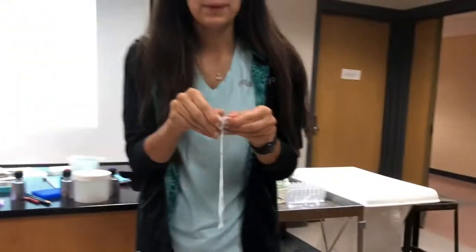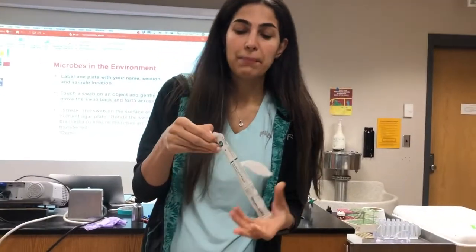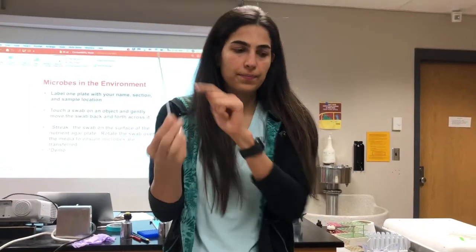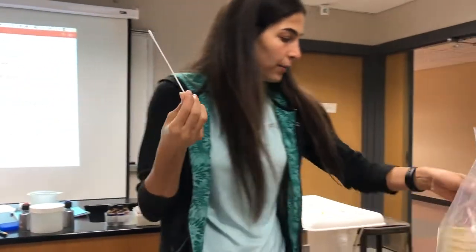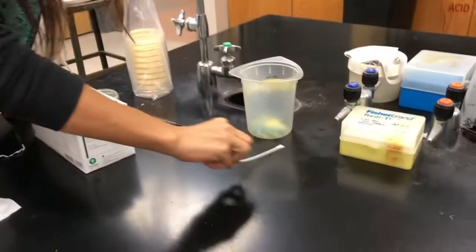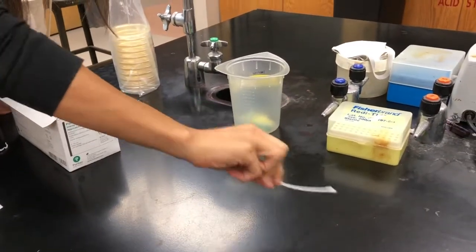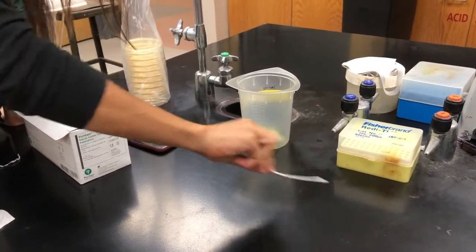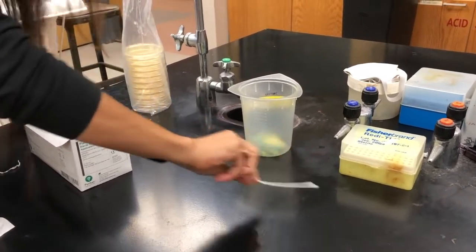You need to open it and make sure you do not touch this part. For the lab, I will grab the sample from the bench. We know that the bench is not clean, right? So we will rotate the swab completely.